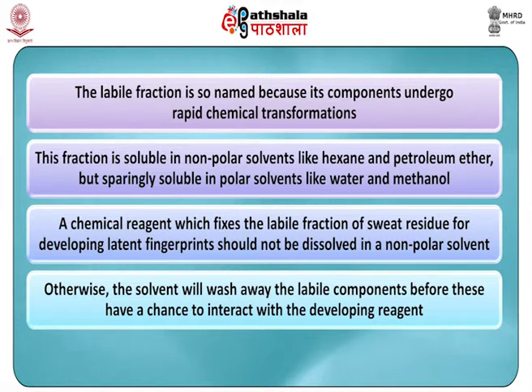A chemical reagent which fixes the labile fraction of sweat residue for developing latent fingerprints should not be dissolved in a non-polar solvent. Otherwise, the solvent will wash away the labile components before these have a chance to interact with the developing reagent.